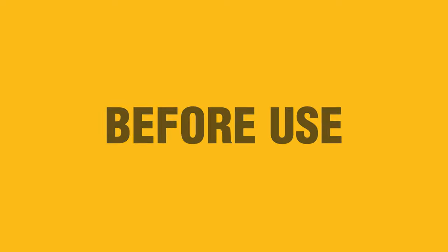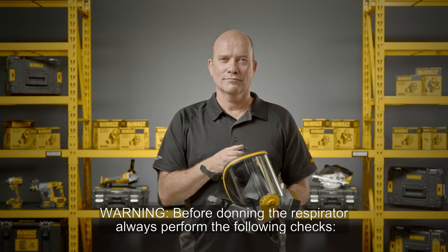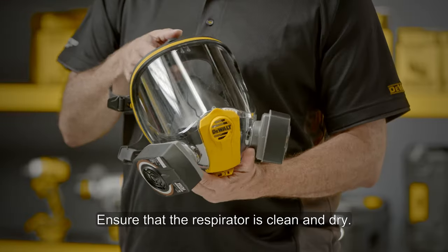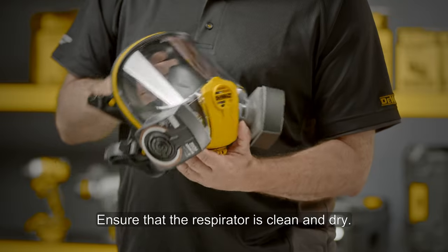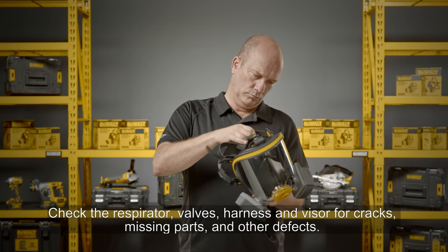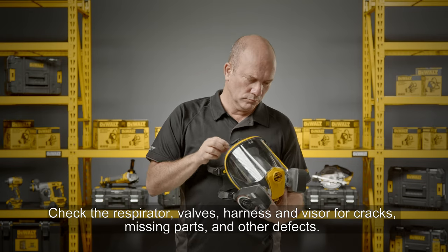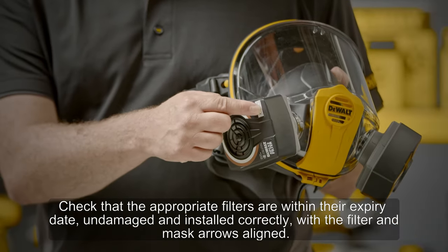Before use warning: before donning the respirator, always perform the following checks. Ensure that the respirator is clean and dry. Check the respirator valves, harness, and visor for cracks, missing parts, and other defects.